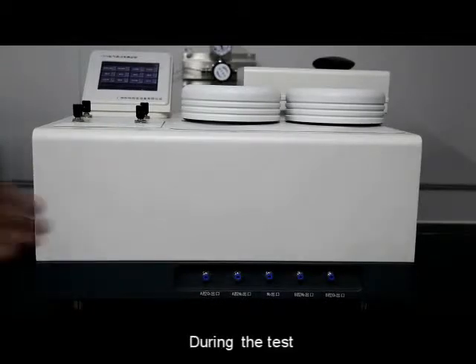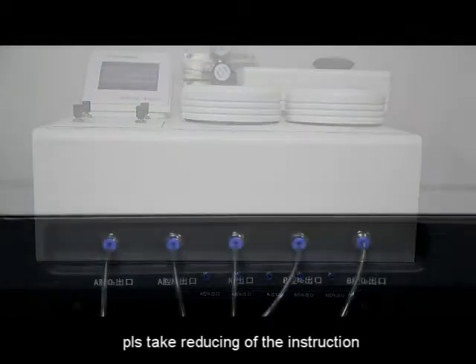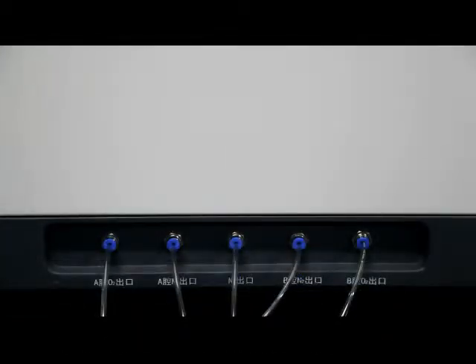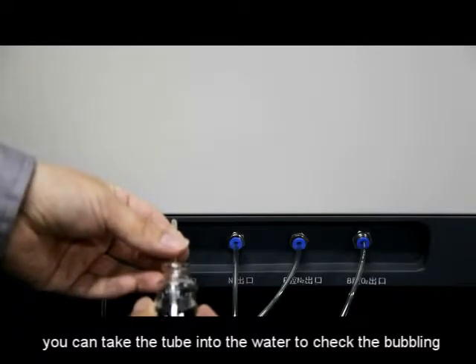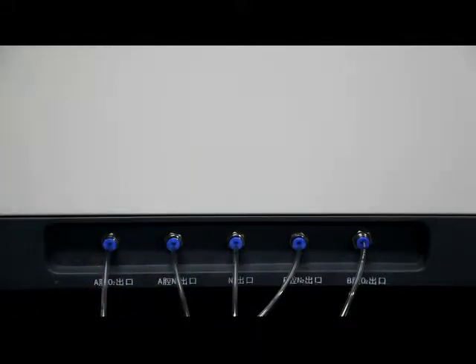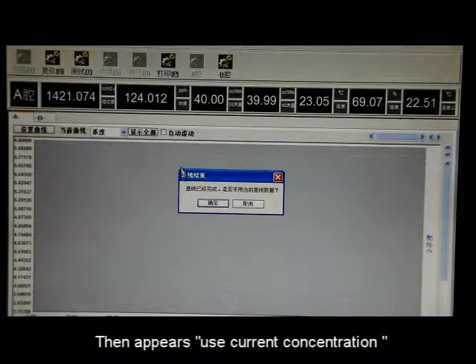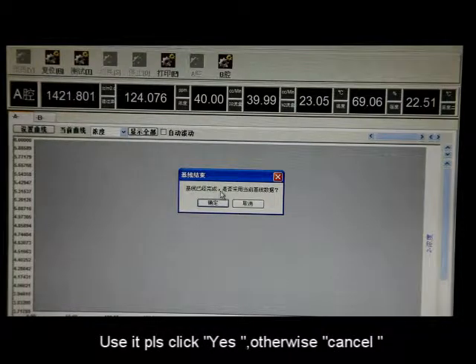During the test, different air outputs will appear at different stages — please refer to the instruction manual. When the air output appears, you can place the tube into water to check for bubbling. Click Stop after the curve stabilizes. Then the prompt 'Use Current Concentration' will appear — click Yes to use it, otherwise click Cancel.